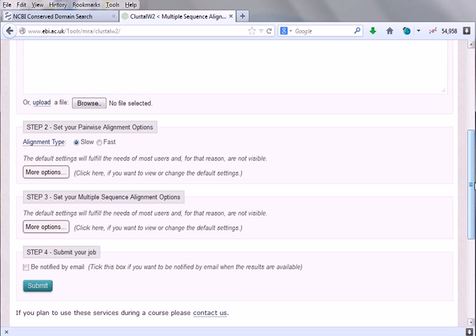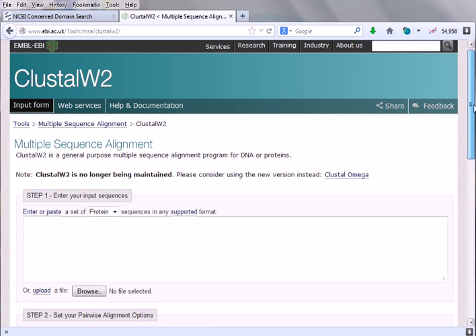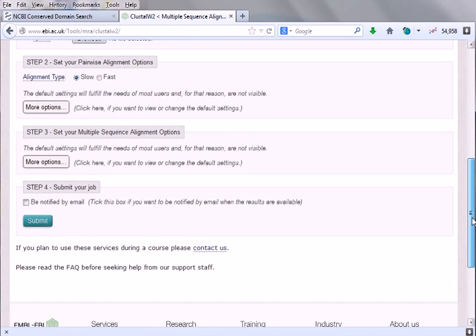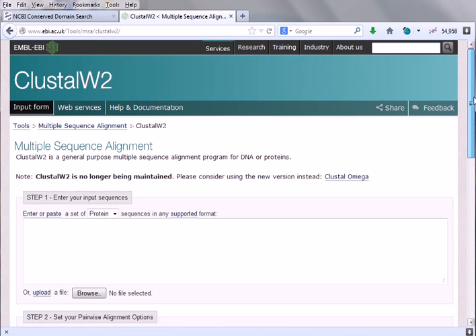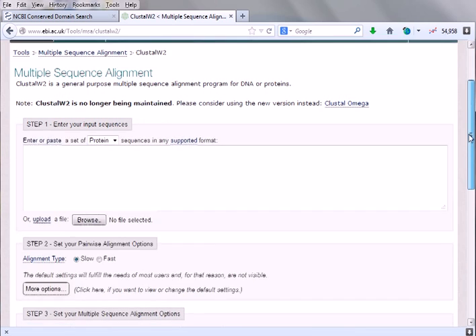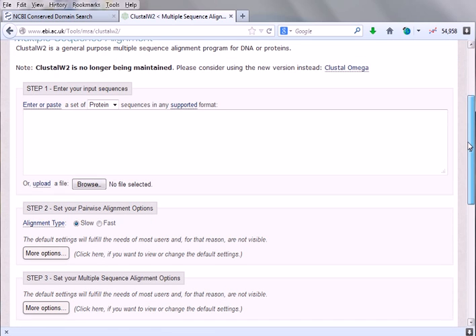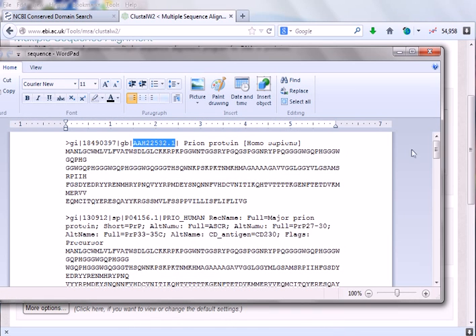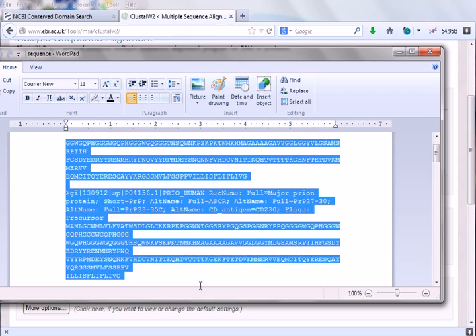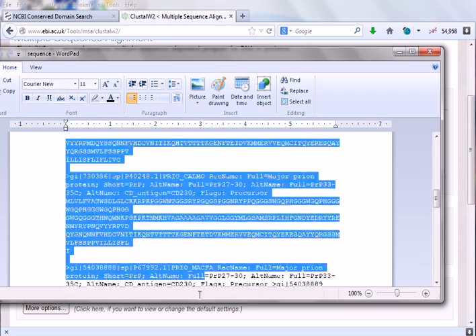When you require to analyze your sequence, you can go to your email to check for this sequence. I'll be guiding that. Here we won't look for that because we'll be staying at the computer screen for the result, so we won't check that box. Let us put the sequences. Remember we are having this 10 sequences here.